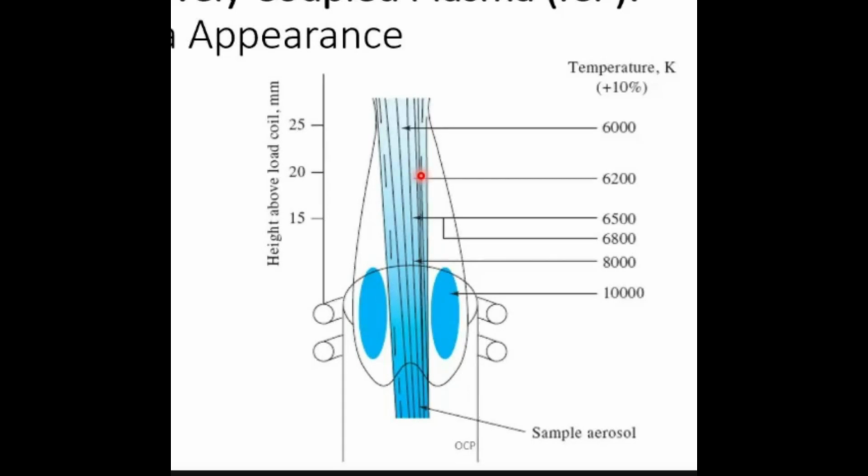Ionization in plasma may be thought to be a problem at very high temperatures. If the temperature reaches very high, the ionization itself may be a problem, because if your sample gets ionized extensively, the ion of your analyte, suppose you are analyzing potassium, sodium, or calcium, the lines given by atomic calcium, when I say lines, I mean the line spectra given by calcium, is different than that of calcium ion.